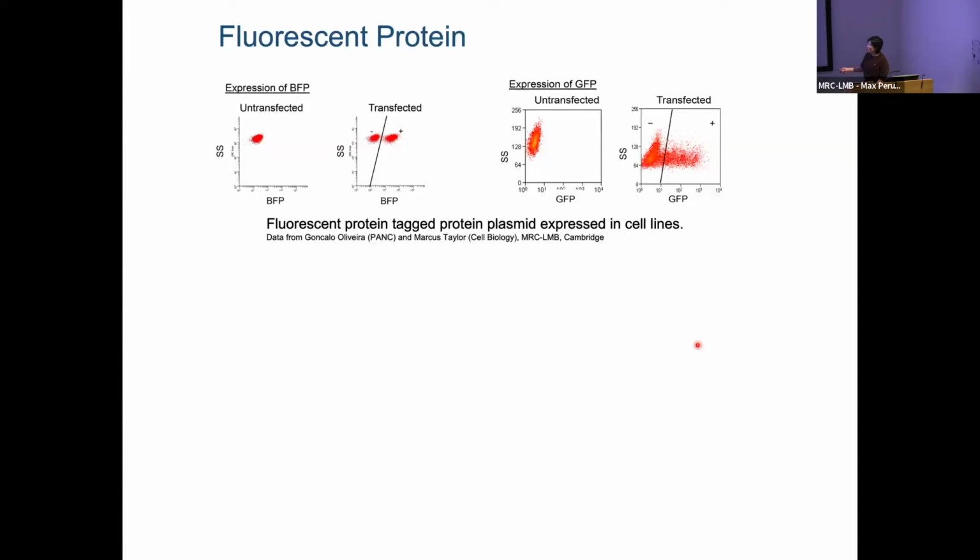The simplest one we always do is fluorescent proteins. Now people are doing CRISPR knockout using fluorescent protein markers, before they were using plasmids. However, the expression of the protein of your interest that is tagged to your fluorescent protein, the expression pattern can be different.